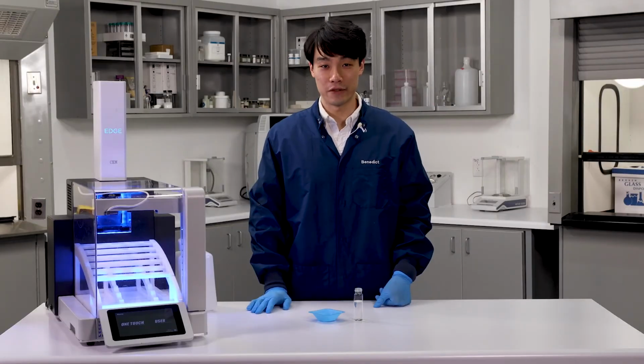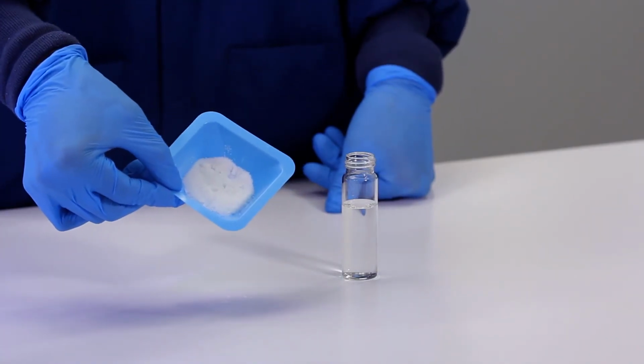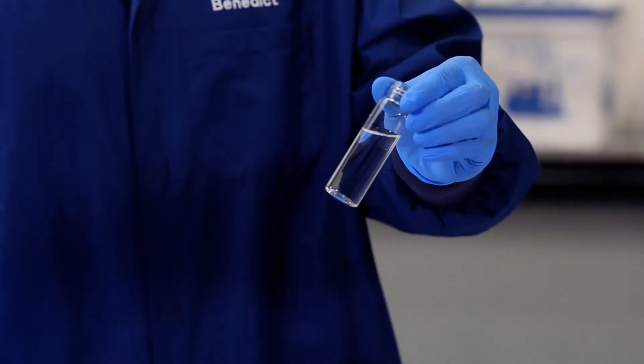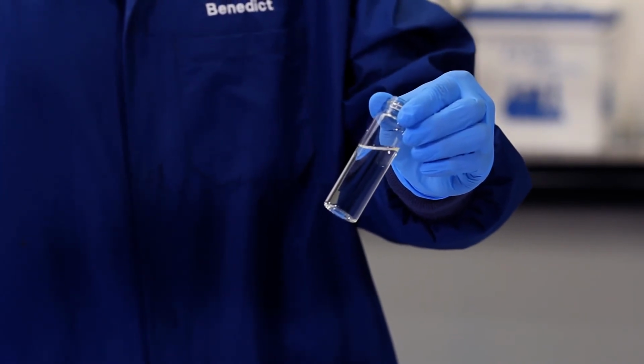And now the Edge has finished its run, so here we have our extracted sample, as well as our extract. You can see that the extract is nice and clear. It's filtered thanks to that Q disc we put in for inline filtration.